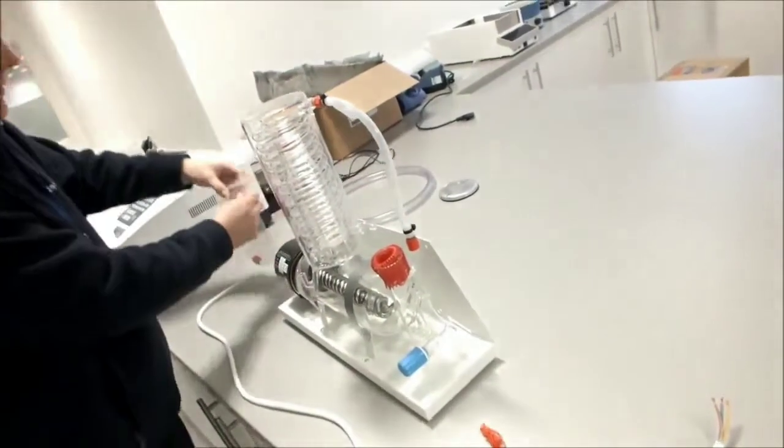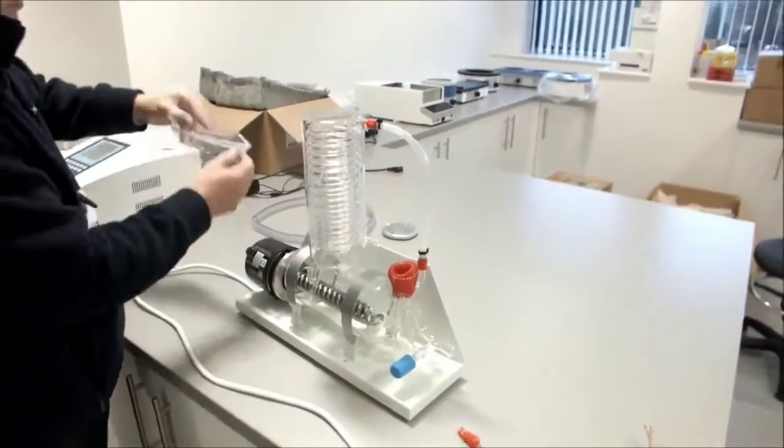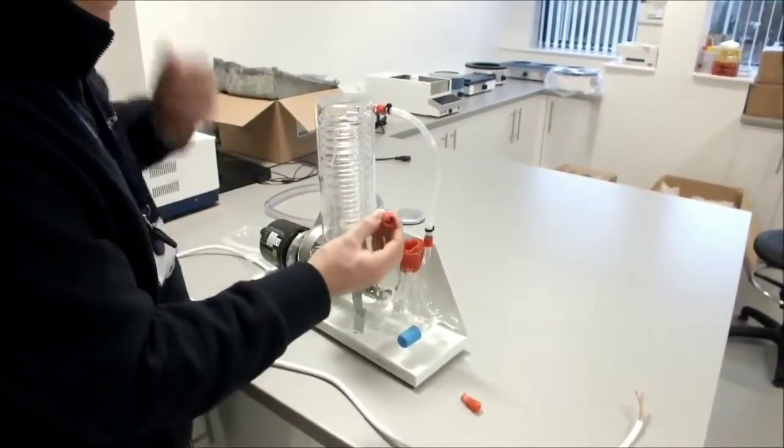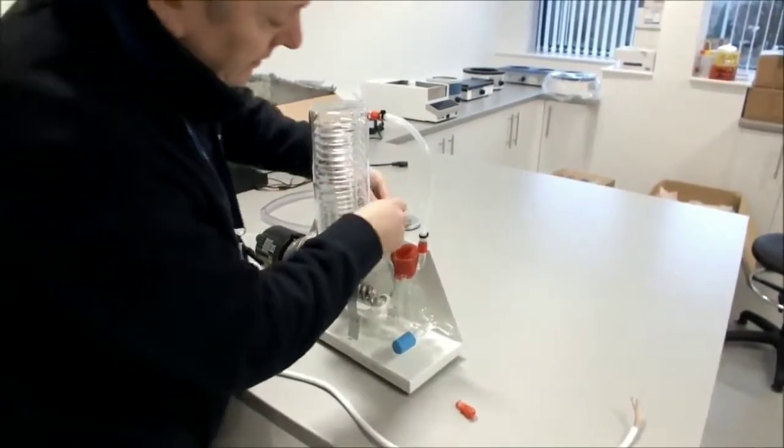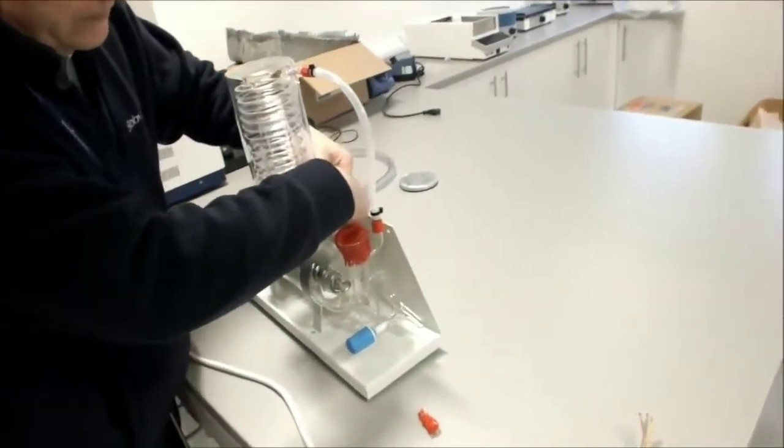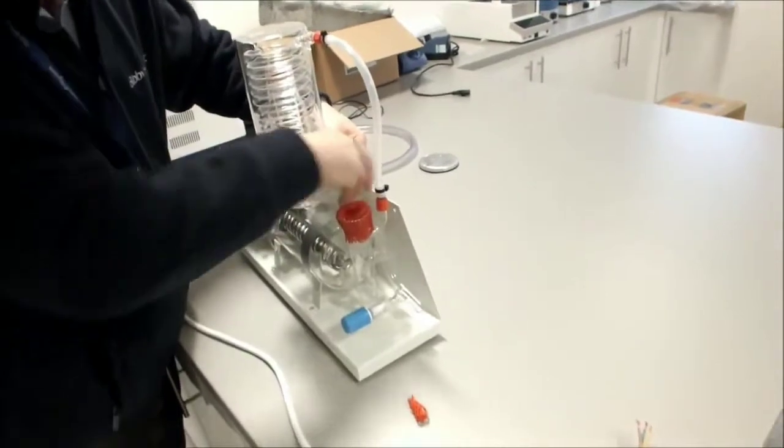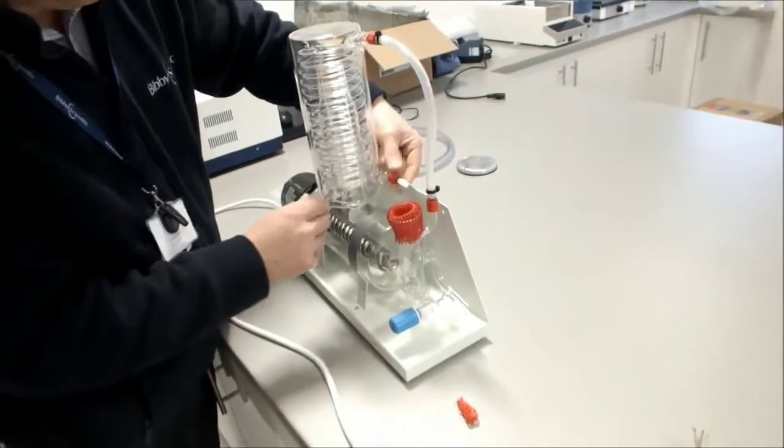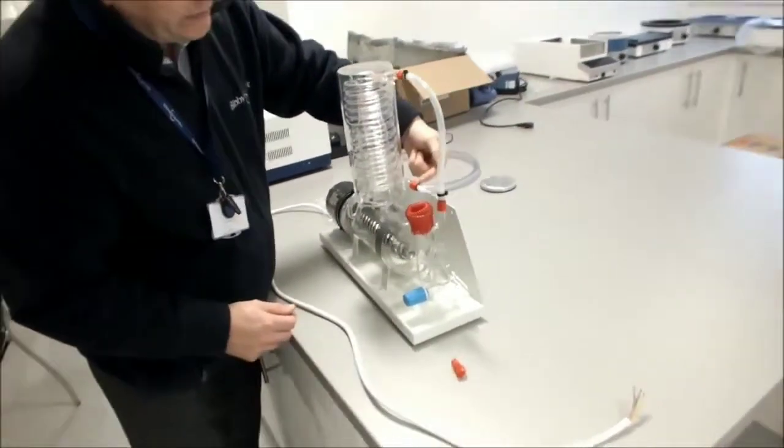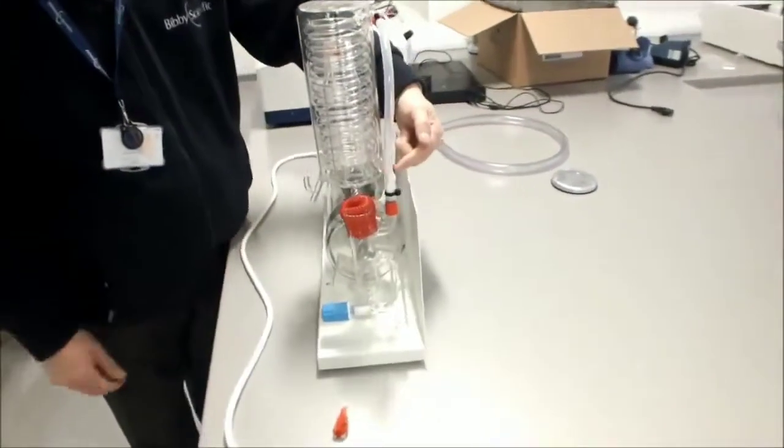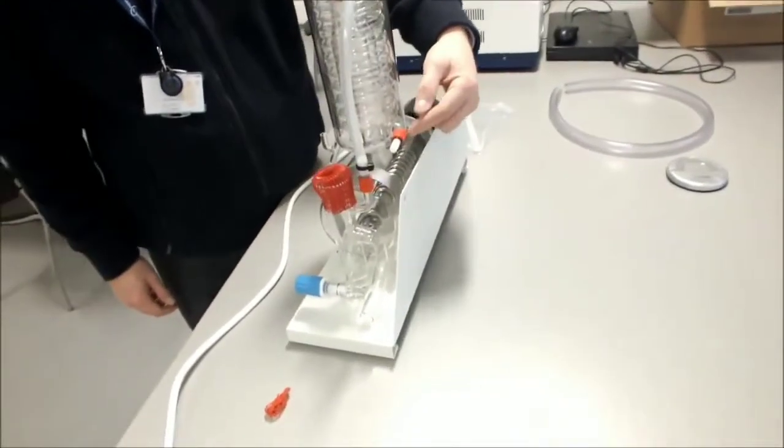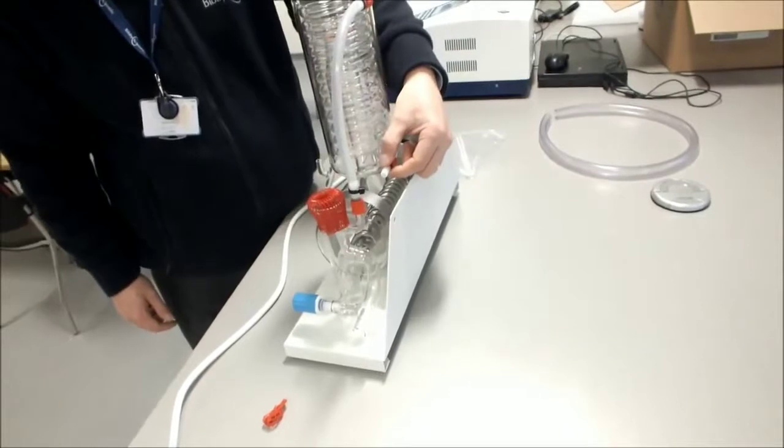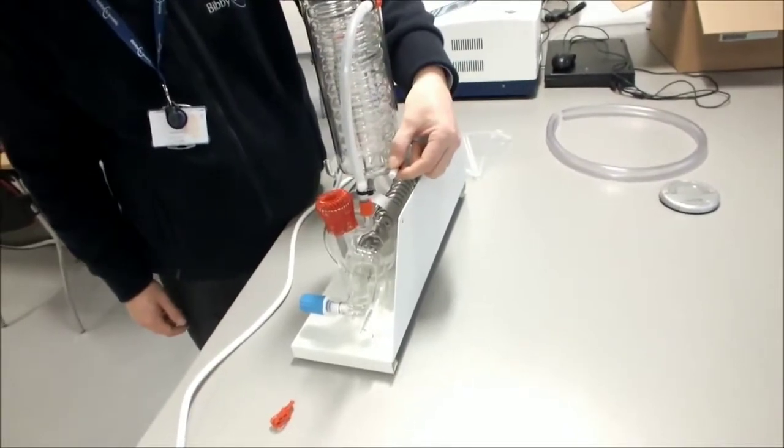We can then take the spare connector from our hose kit and connect that to the cold water inlet connector to the condenser, which is on the lower. This then is the connection you will make to your cold water supply. Use quality tubing and make sure you use hose clips, tie wraps, etc., when connecting it onto it.